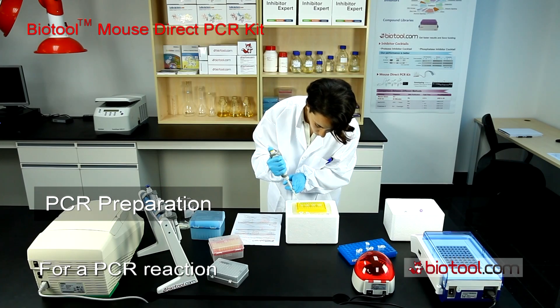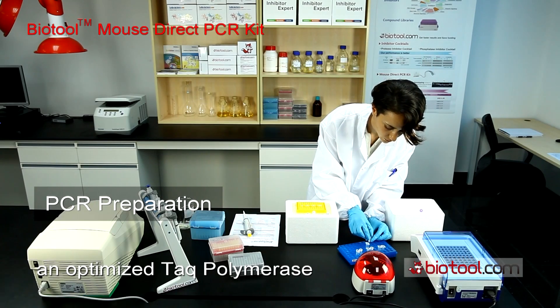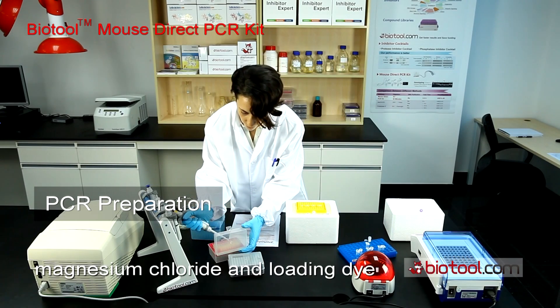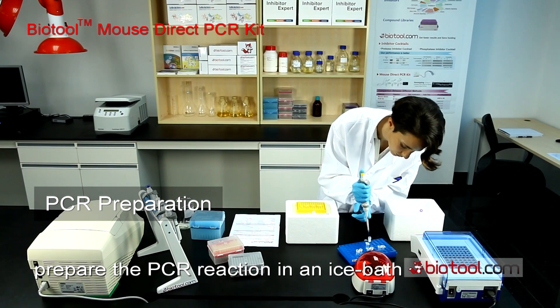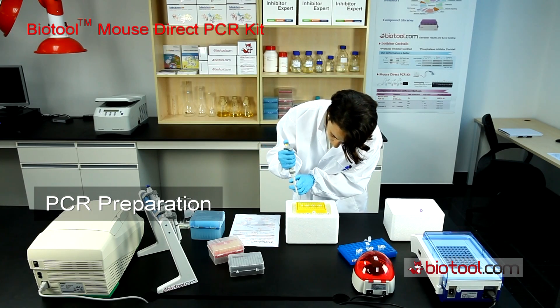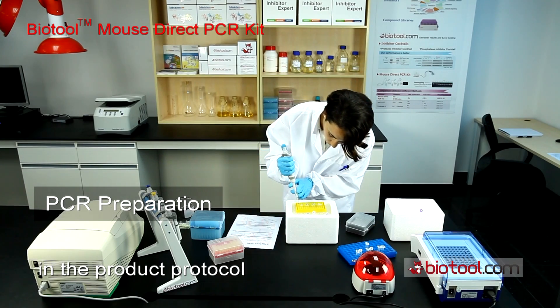For a PCR reaction, use the PCR mix which includes an optimized Taq polymerase, dNTPs, magnesium chloride, and loading dye. For best results, prepare the PCR reaction in an ice bath. The volume of each component should be added according to the recommended concentrations in the product protocol.